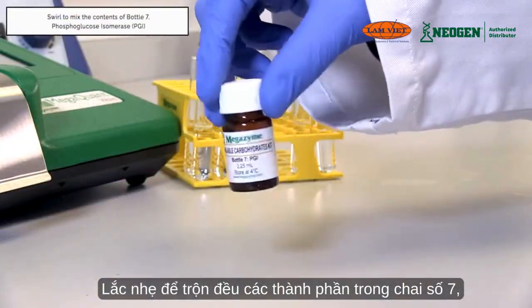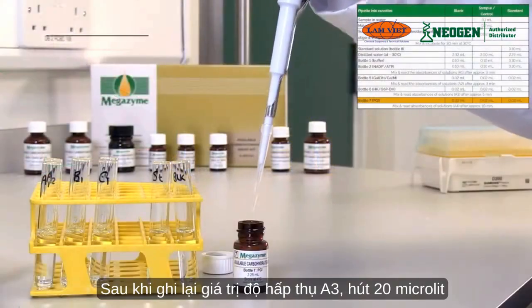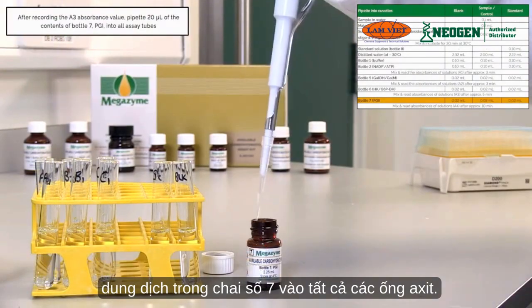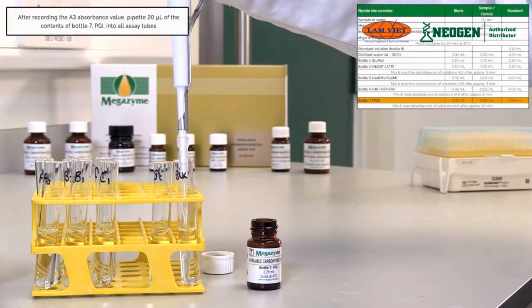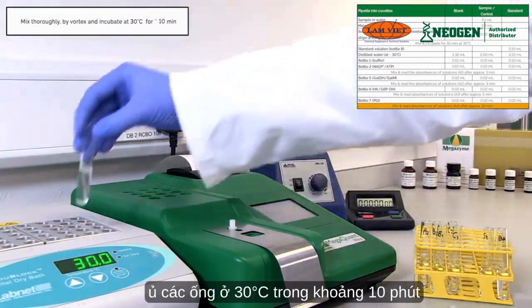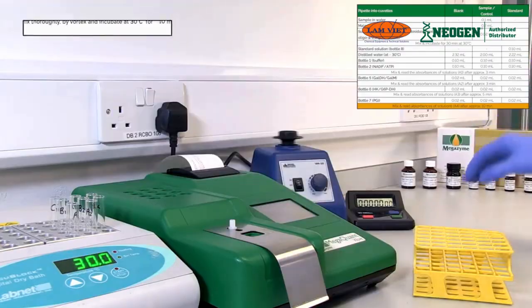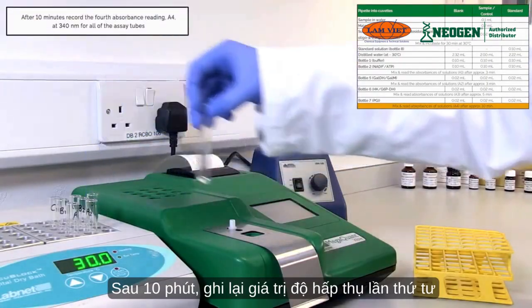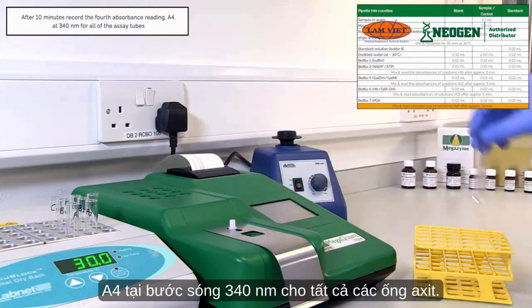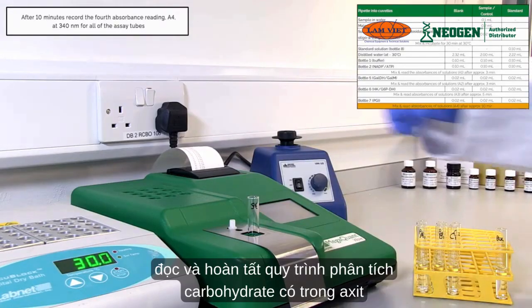Swirl to mix the contents of bottle 7, phosphoglucose isomerase, prior to dispensing. After recording the A3 absorbance value, pipette 20 microliters of the contents of bottle 7 into all assay tubes. Mix the tube contents thoroughly and incubate the tubes at 30 degrees Celsius for approximately 10 minutes. After 10 minutes, record the fourth absorbance reading, A4, at 340 nanometers for all of the assay tubes. This absorbance reading completes the available carbohydrate assay procedure.